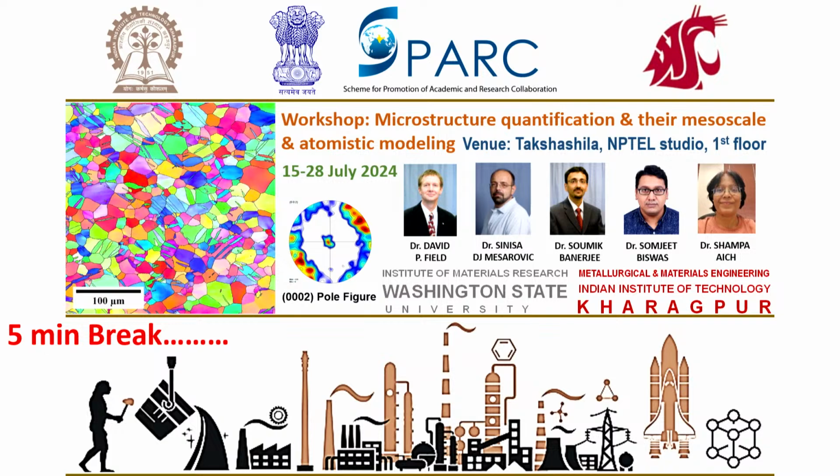So the gamma fiber, actually it's not much difference. There's not much gamma fiber on this one. This is an FCC friction stir weld, it says. But if you come within 20 degrees, instead of 6%, you get, is that 64% or something? So 20 degrees jumps way up there. So that's looking at volume fraction within a given angle of an orientation, or within a given angle of a fiber. That's the crystal orientation. It also gives the volume fraction of gamma fiber. This has been in your teaching, right? The question was, how do you determine volume fraction of a given orientation component?